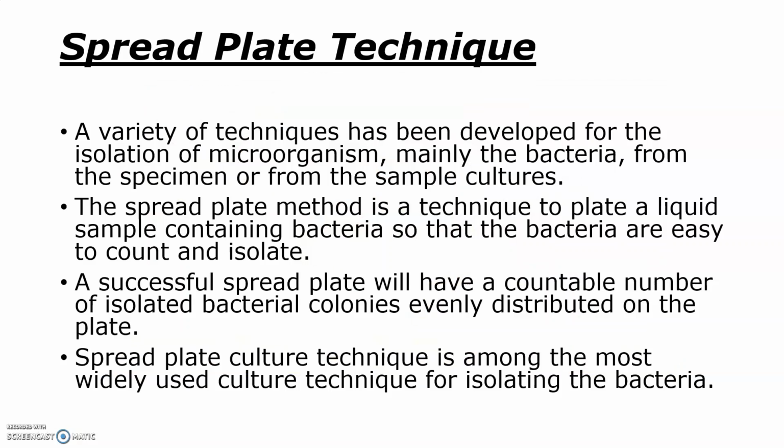A variety of techniques have been developed mainly for the isolation of microorganisms, mainly bacteria, from a specimen or from sample cultures. The spread plate technique is used to plate a liquid sample which contains bacteria so that the bacteria can be easily counted and also isolated.